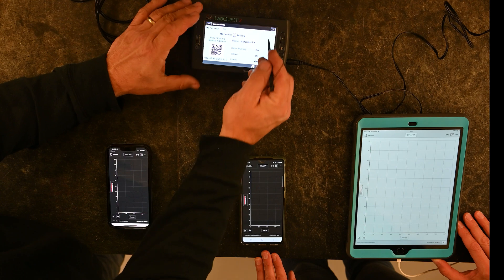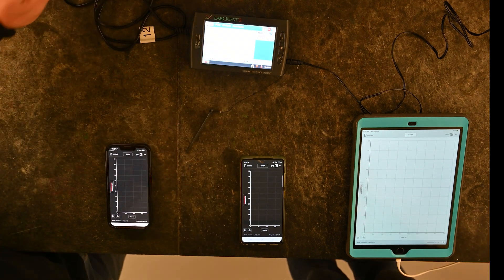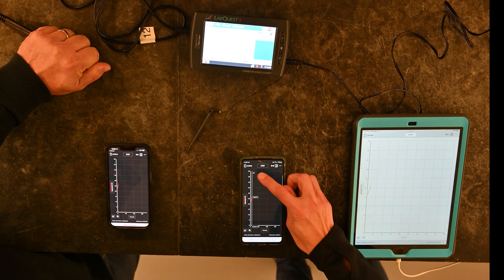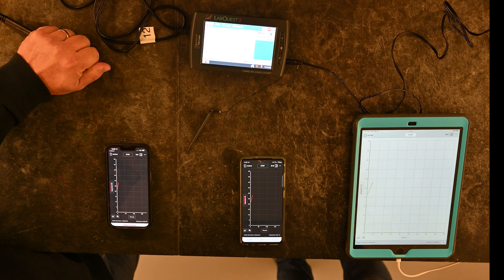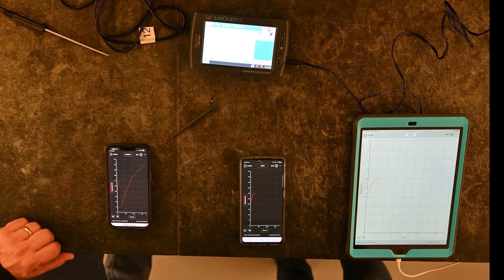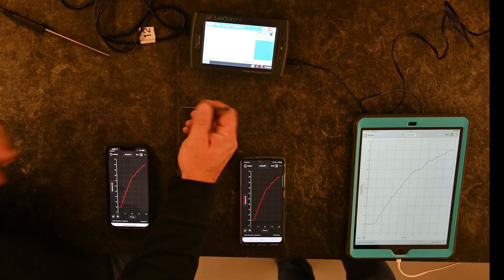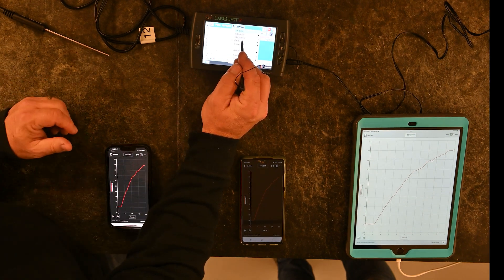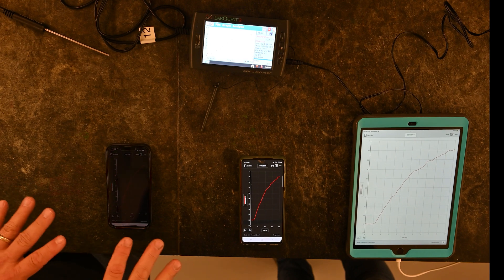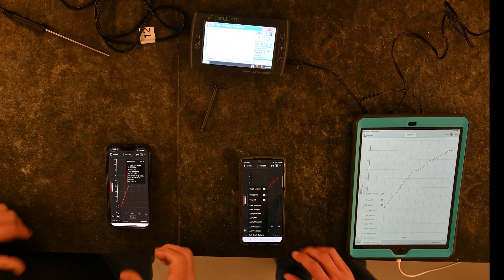Back on the LabQuest device, go to the main screen with the temperature sensor and hit collect. You'll notice that all three connected devices are collecting data simultaneously. Once you stop, all three will have the collected data. Note that if you go into the LabQuest and perform analysis — like pulling up statistics — that analysis does not push to the student devices. Students can still run statistics on their own devices, but they have to initiate it themselves.